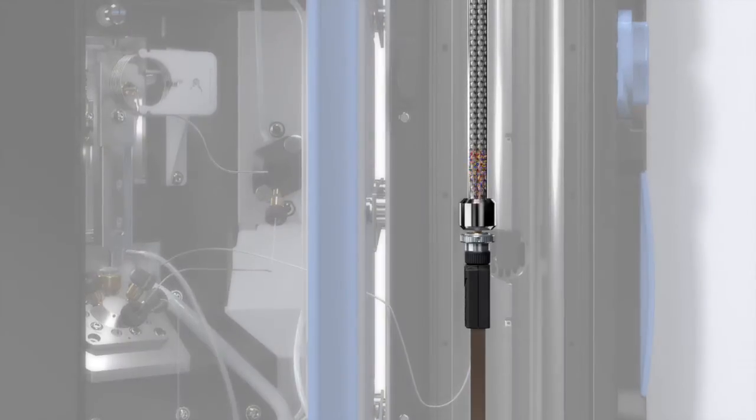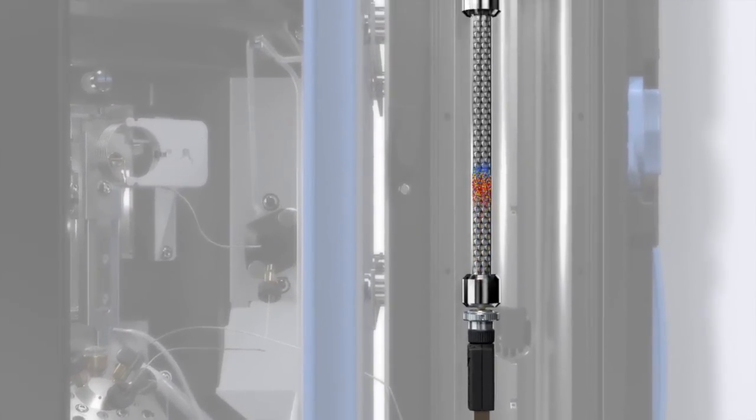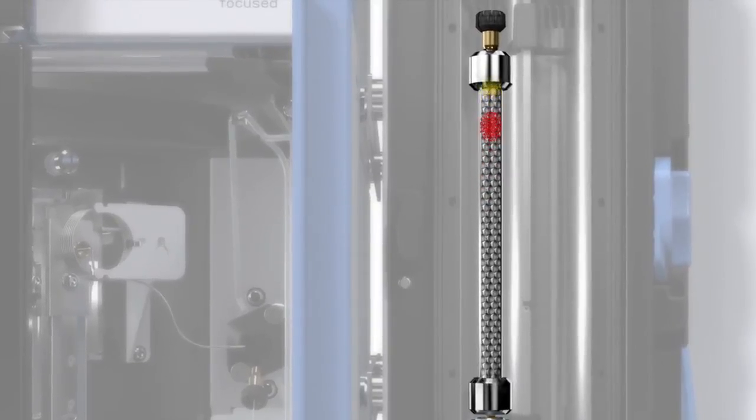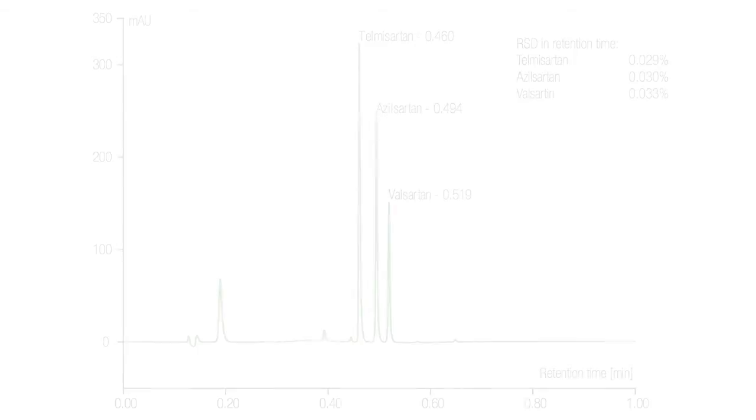the entire fluidic design needs to focus on the column as the core of separation. The low dispersion, Thermo Scientific Viper finger-tight fitting capillaries and optimized fluidic flow path translate the separation power of your column into superb chromatograms for a resolution that matters.